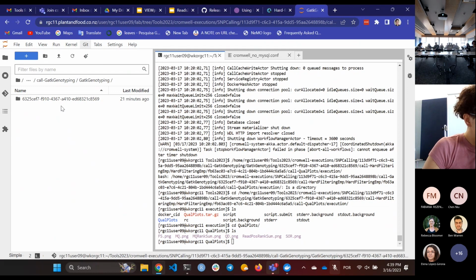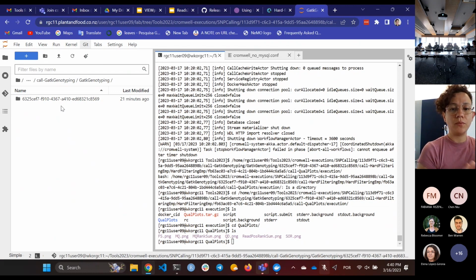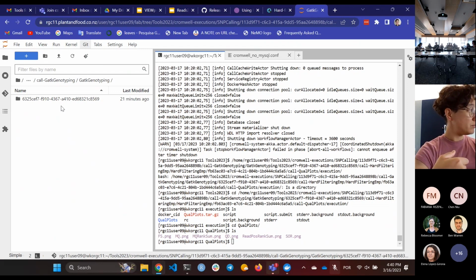Processes are trying to access. It's good, no matter what. Max, I don't know if it's worth doing that or not. Are you good now? Have you gone past that step? I don't know if people want to make it work, because I think running the workflow again will take time, even if it fixes it. Okay, so you have to start again. Ben's great. It's just some processes being killed, but then you just have to try it again.